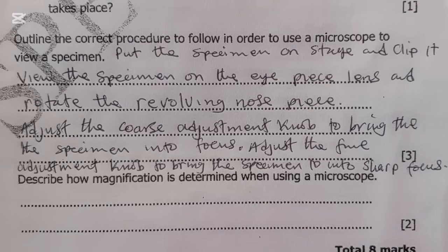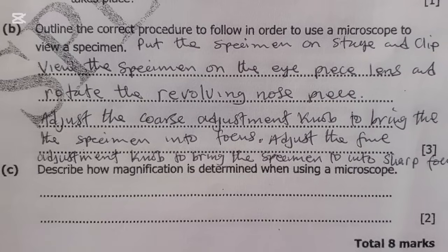So that is the procedure that we need to follow. So put the specimen on stage, clip it, view the specimen on the eyepiece lens, and rotate the revolving nose piece. Adjust the coarse adjustment knob to bring the specimen into focus. Adjust the fine adjustment knob to bring the specimen into sharp focus. But see, describe how magnification is determined when using a microscope.